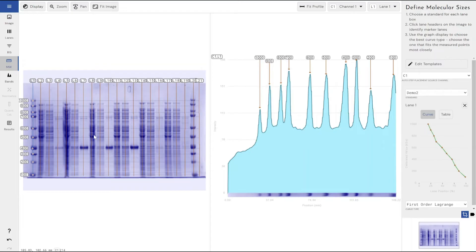That's why we have two different settings, two different parameters for both of those, and one of those you don't have the option to be able to change, which is the molecular weight ladder.